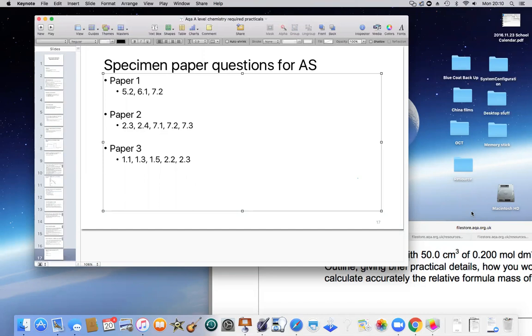When do we double the percentage error? Is it just if you've taken a measurement? Essentially, yes. If for a piece of equipment there is a start reading and a final reading, and you have to measure both. So burette, you have your start titer, your end titer. If your uncertainty is 0.05 for your start and your end, you have to double it. So rulers and burettes are two pieces of equipment that you're going to be most concerned with.